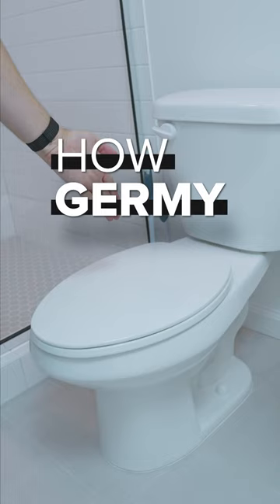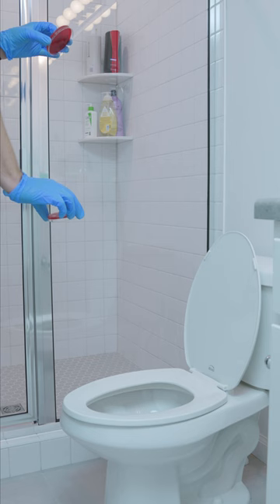I'll be capturing these tests with a blood agar plate, placing one at counter height at about 20 inches and one at 30 inches. All right, here we go.